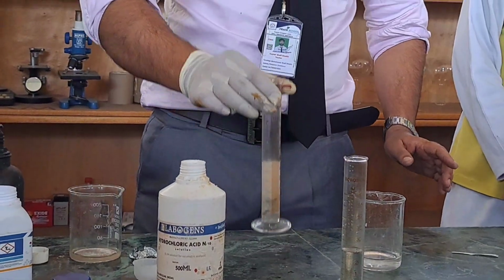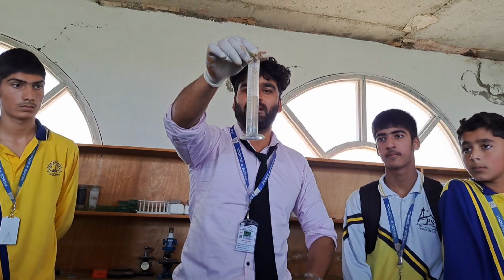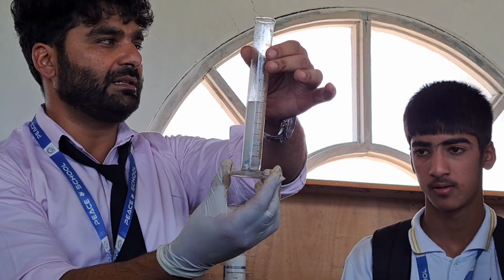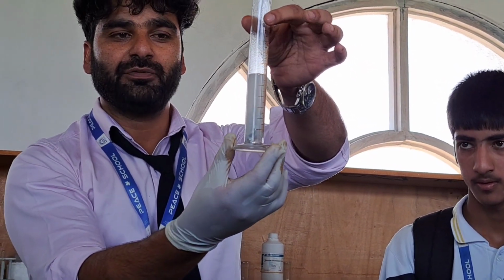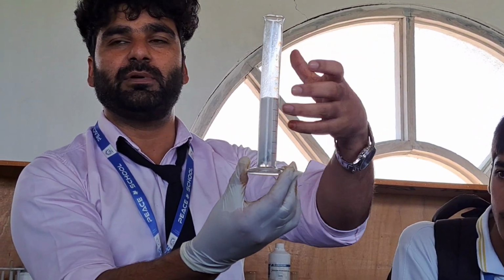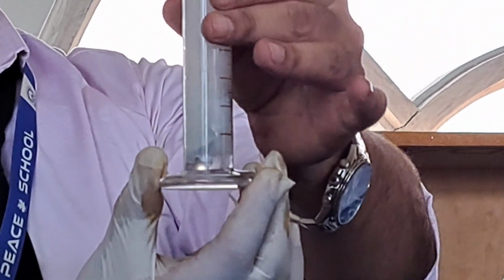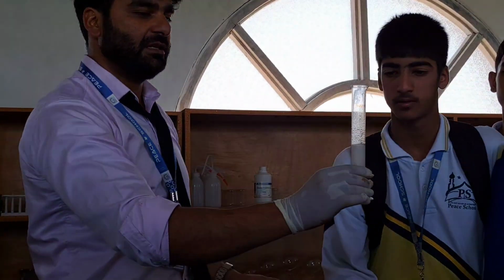See, now the reaction is very fast. See the formation of hydrogen gas. It is a colorless gas. See the bubbles. See the reaction going on. I have made this solution a little bit more concentrated now. It was more dilute, which I had initially taken. Now see the bubbles of hydrogen gas coming. If I take a burning matchstick to this, you will get the pop sound, because hydrogen gas is a fuel and it burns. If you want to touch this tube, you cannot touch it because it has become hot now.